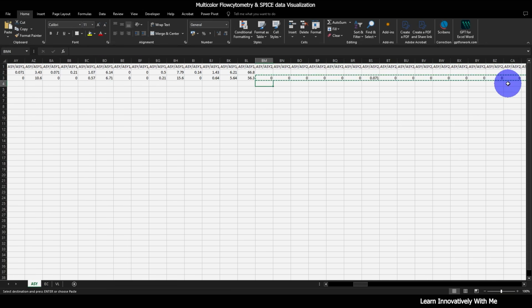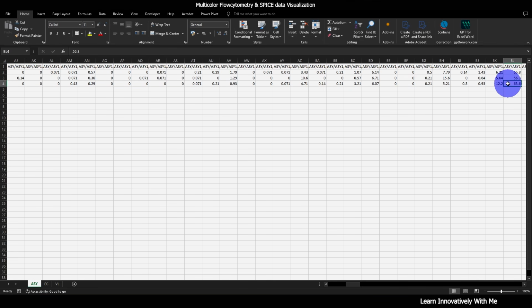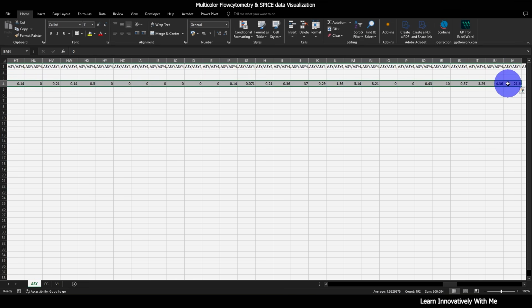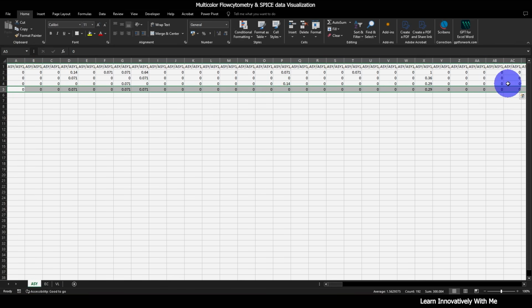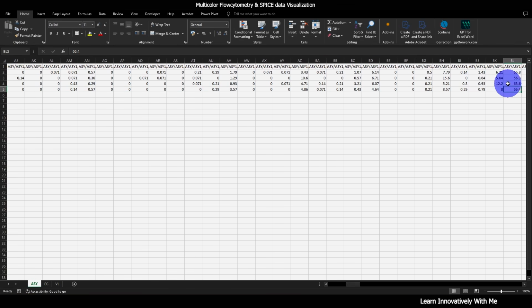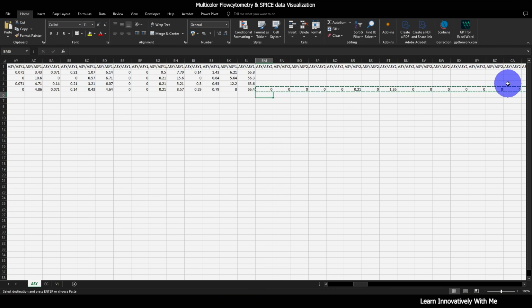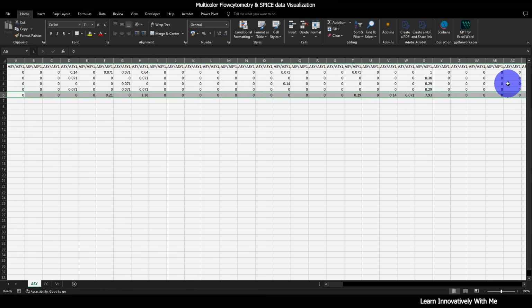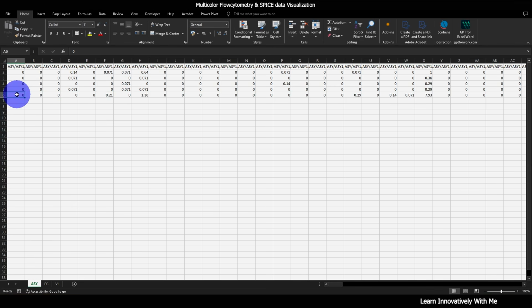Control X, follow the same thing that I have discussed with you to make the combination of each individual like this. So you can use anything that is convenient for you. Anyhow, you just have to prepare your data in the combination form like this.